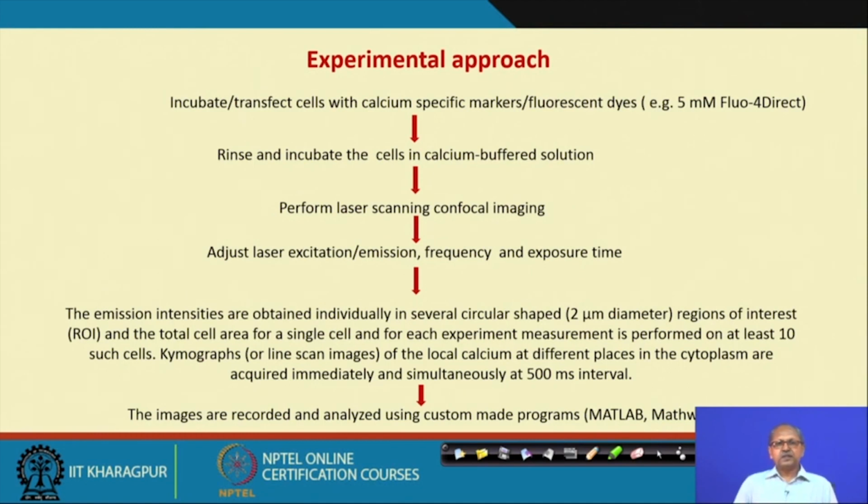In our lab we are working on bone cells, like MG63 cell lines, and normal, native cell lines from mice calvaria, that is osteoblasts, for calcium signaling purposes using mechanotransduction.